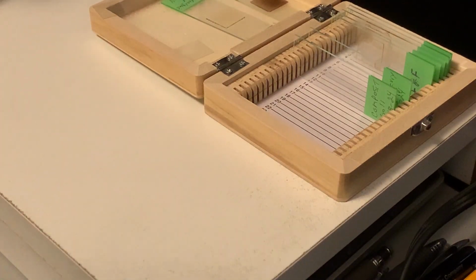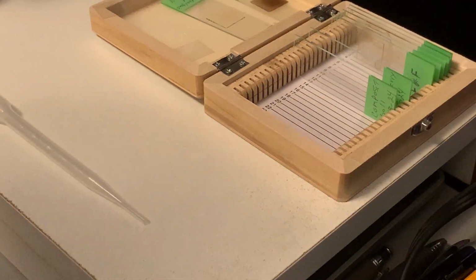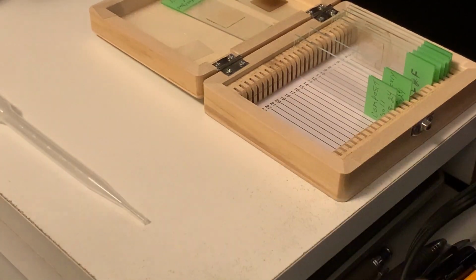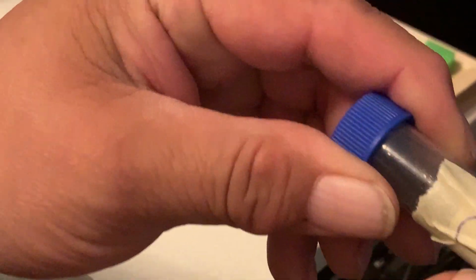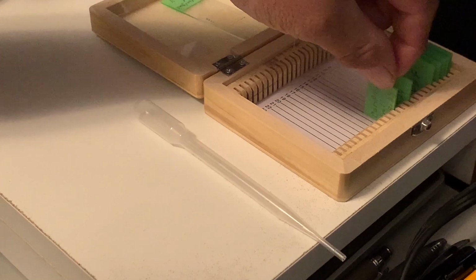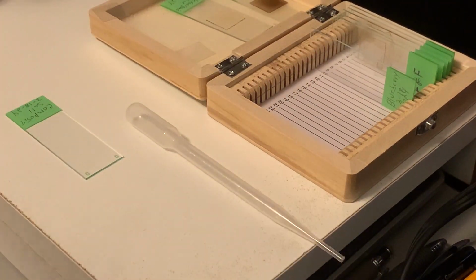All right, next one is compost. This one. All right, get the pipette. How many are we done? 1, 2, 3, 4. Okay, compost. And then let's get the compost slime.